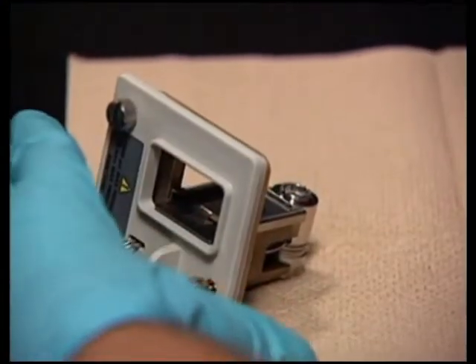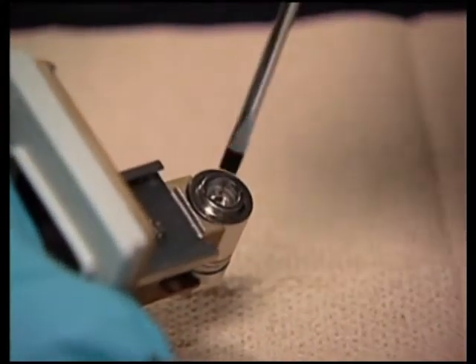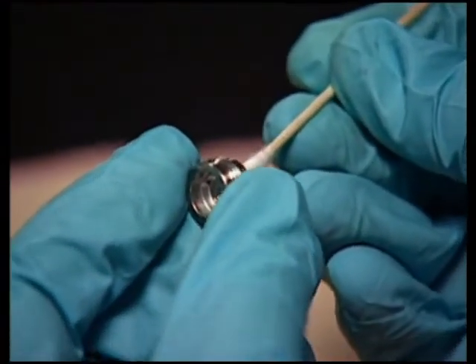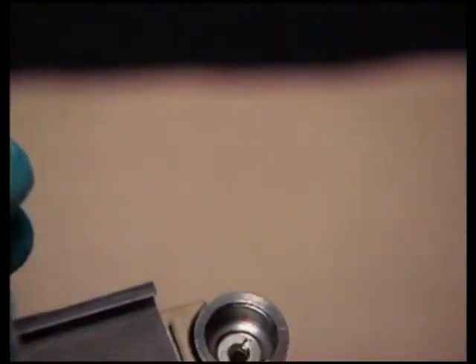Position the notches on the flow cell cuvette lens end facing you. Then, using a tool that will not scratch the lens, remove the cuvette lens screw. Insert the cotton end of the lint-free swab into the cuvette end and remove the split ring and the cuvette lens.